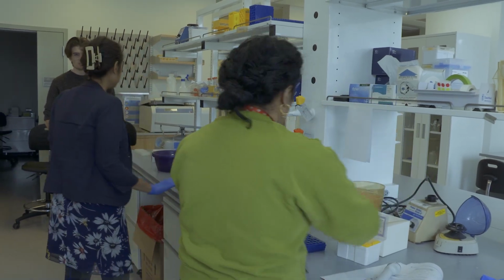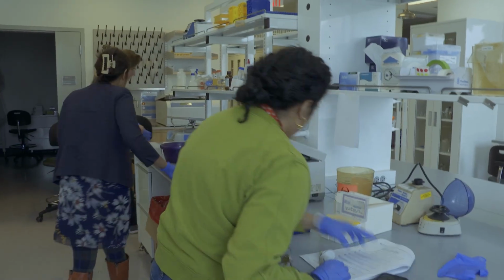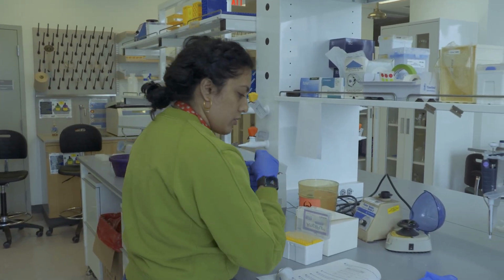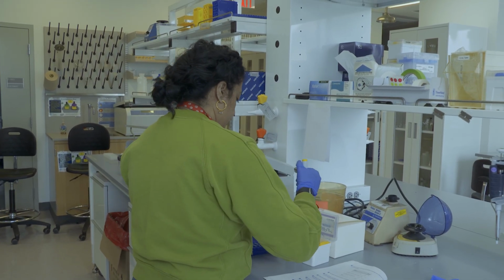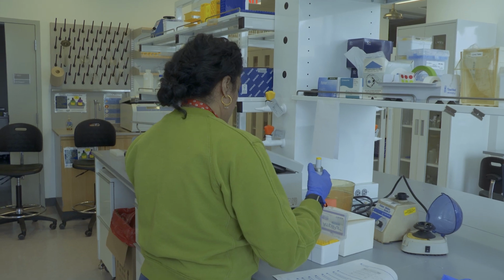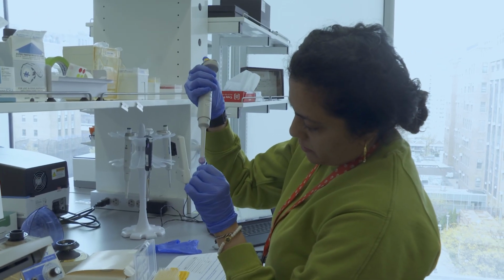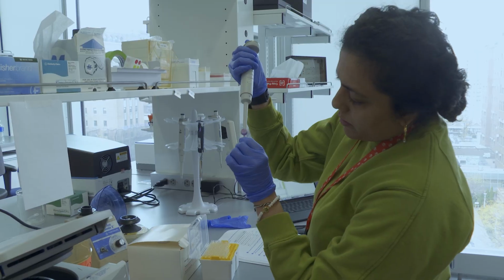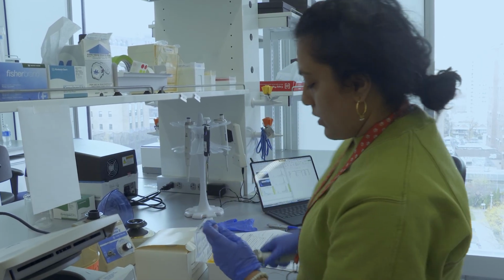So you have 37 degree, like which thermocycler you want to use today? I can show you. Let's make it 37 degree. Also, there are like 6 tubes, right? Let's mark it. PCR tubes are over there, and we'll just mark and label. So let's keep it 37 degree. We also set it up, and you can check 4 steps as they go. So we have like step 5.